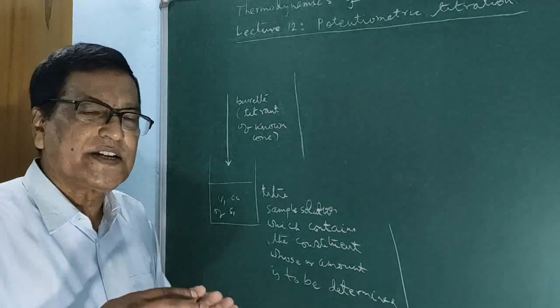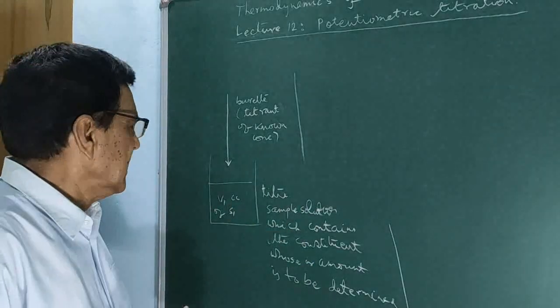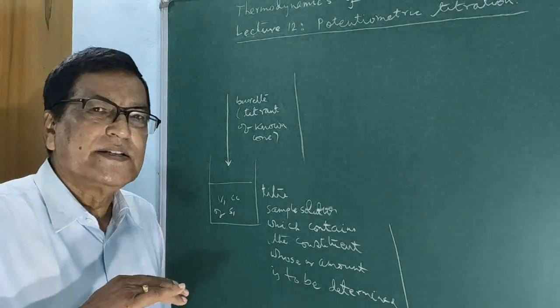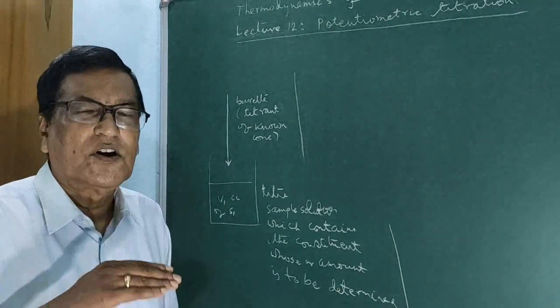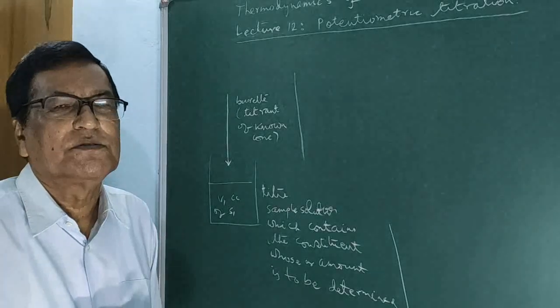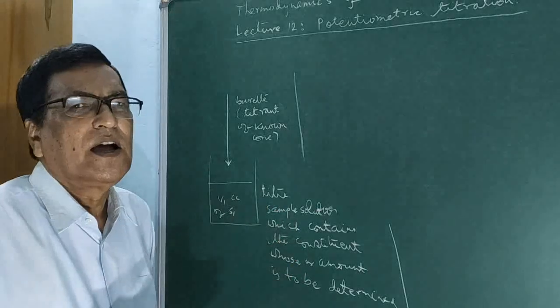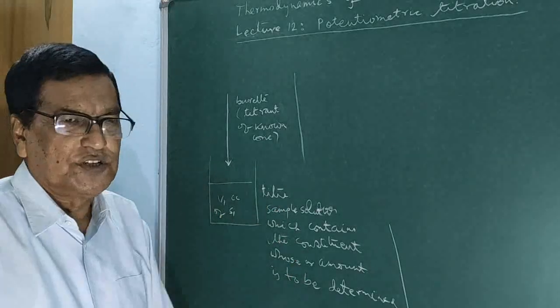In all the cases, at this end point, there is a sharp or abrupt change of the electrode potential or the conductance or the current passing through the solutions.